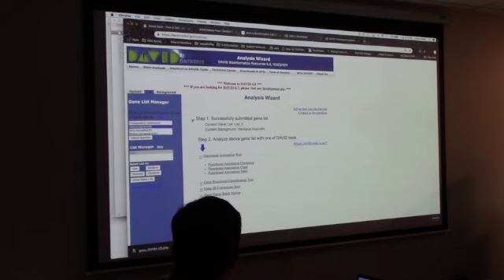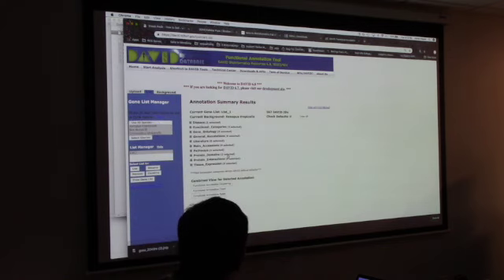So we're going to use that, and then again it gives some error. So this was the problem that I was having last time. Okay, let's click this, and even after specifying the species multiple times, they still haven't corrected this error.